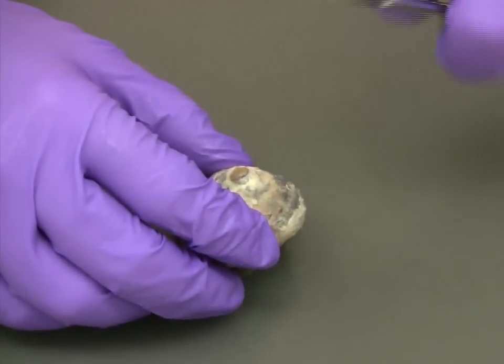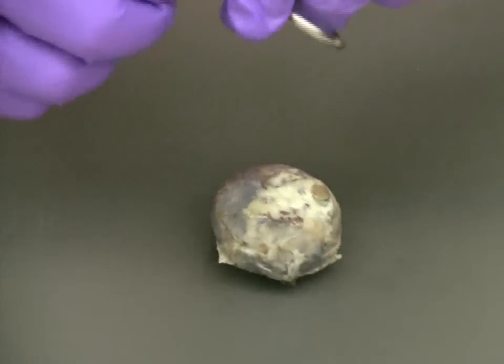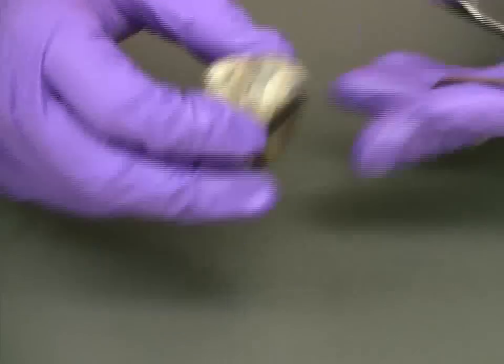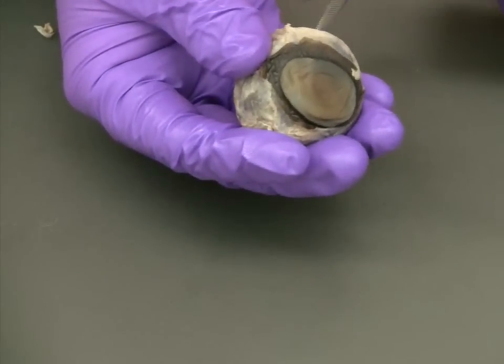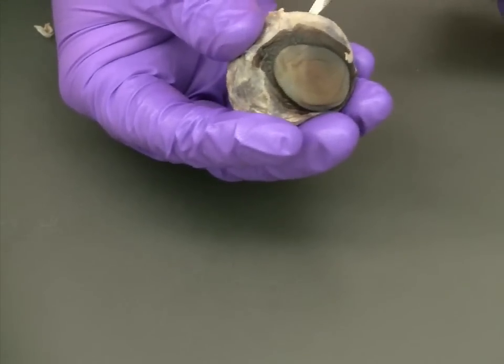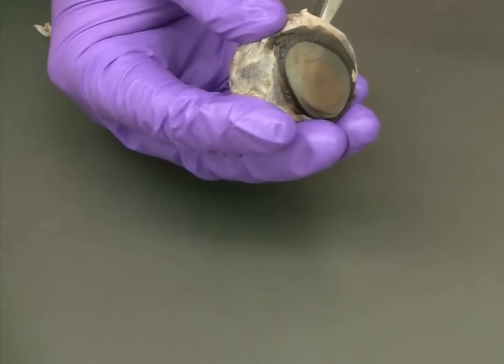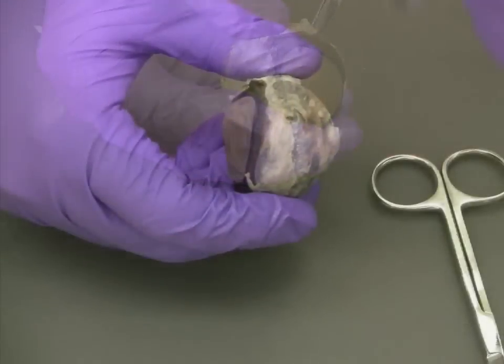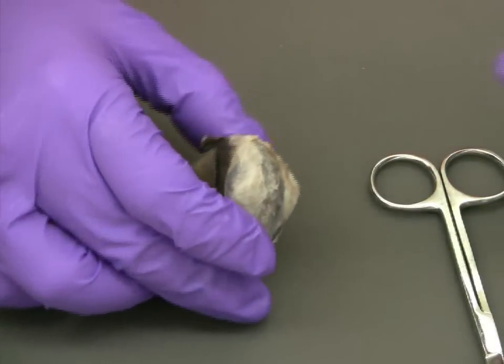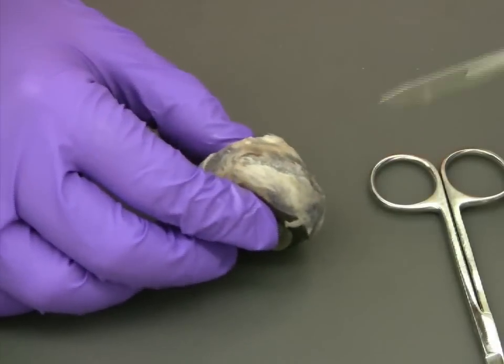The next step is gaining access to the interior of the eye. To do that, we're going to use scissors and make a transverse incision along the outside of the eye. If you have blunt scissors or are having trouble getting the incision started, you can use the scalpel.